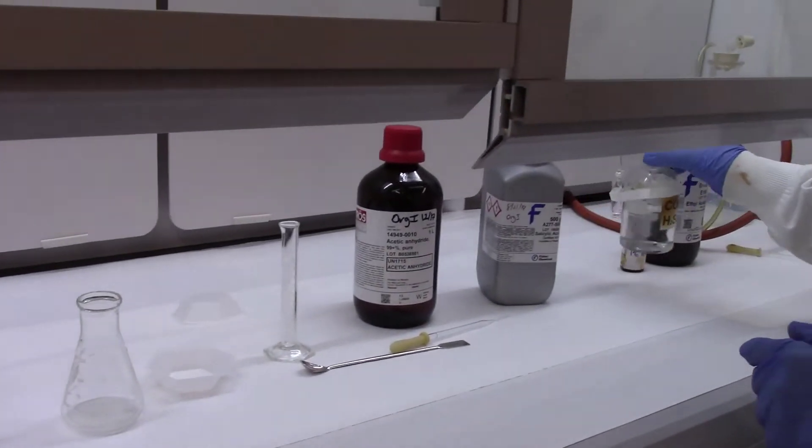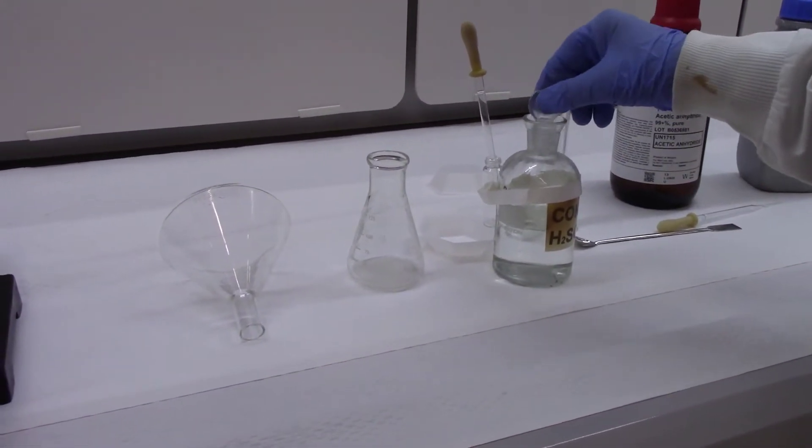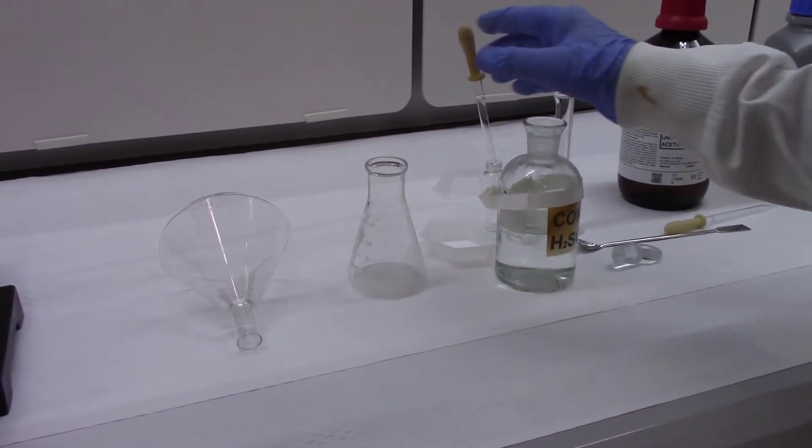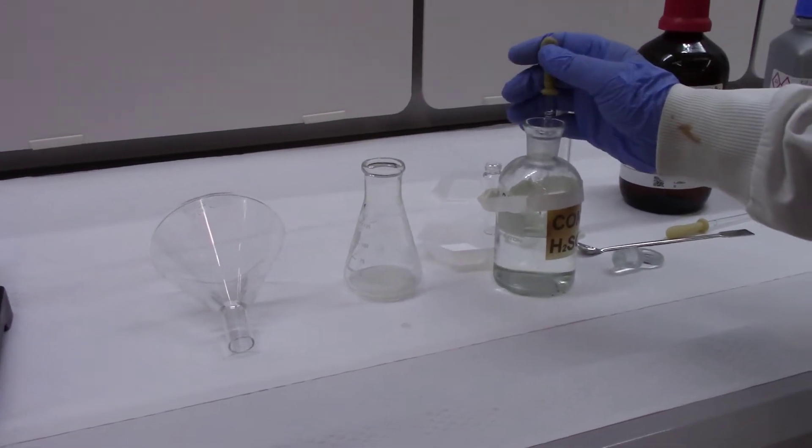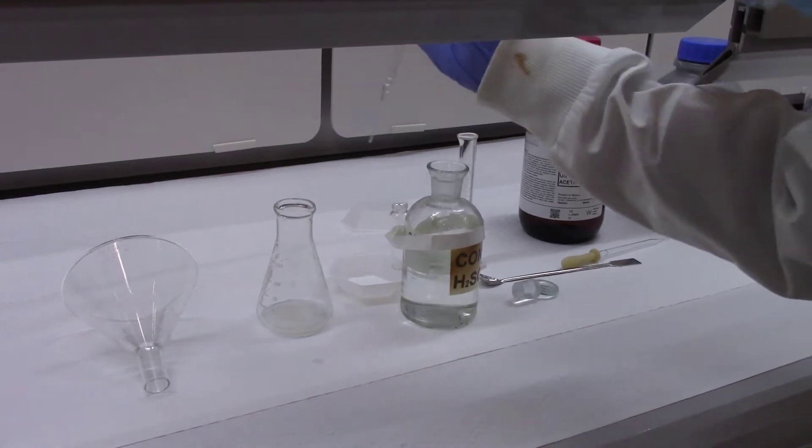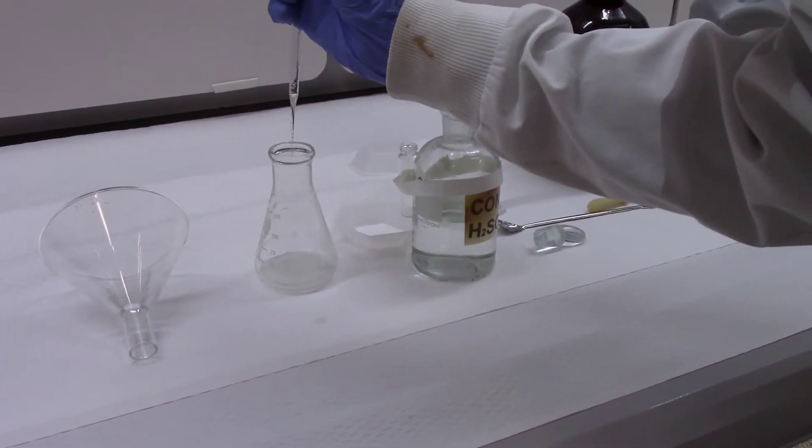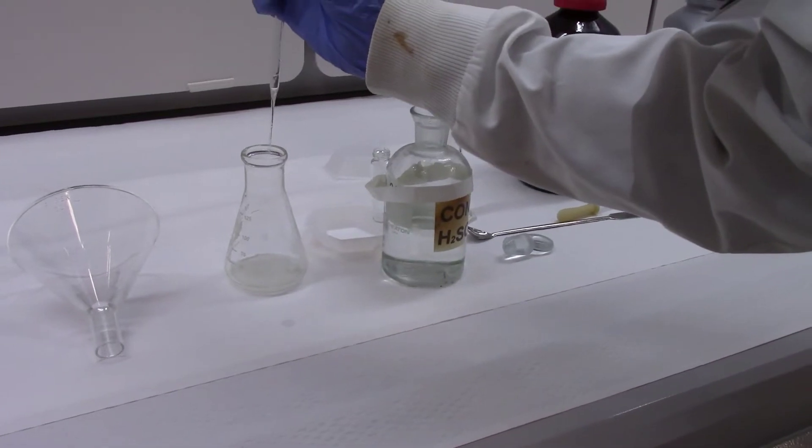The addition has to be portion-wise but it doesn't have to be very slow. Once you have finished adding it, now you have to add the catalyst, sulfuric acid. Be careful about sulfuric acid. Always wear gloves. You add five drops of it. Sulfuric acid is highly corrosive, it's a very dangerous chemical. You need to be very aware of that.